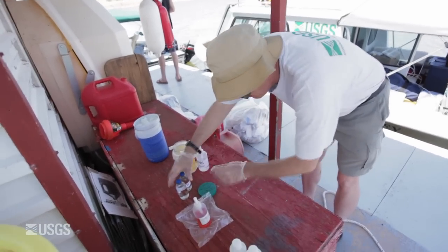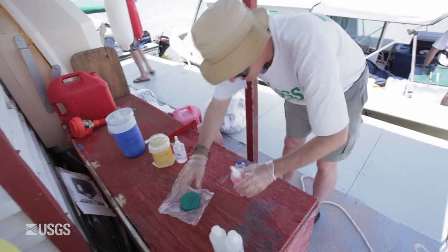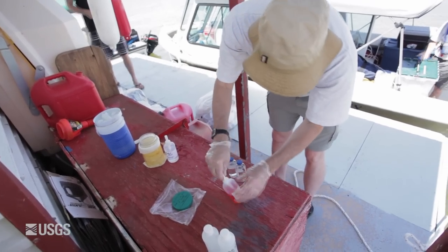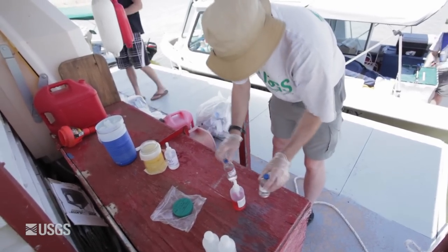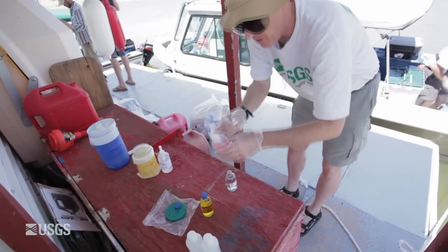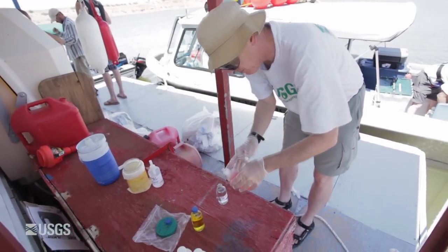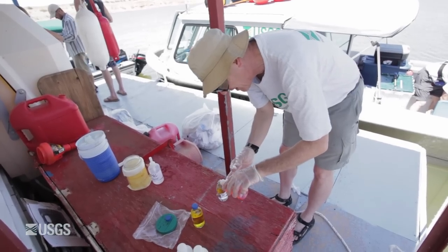The second preserved sample is mercury. The preservative is a concentrated solution of nitric acid and potassium dichromate. Mercury being volatile, we need to fix it. Once a mercury sample has been dosed in this way, it is stable for a long time — meaning months.